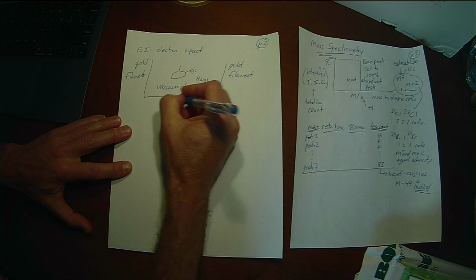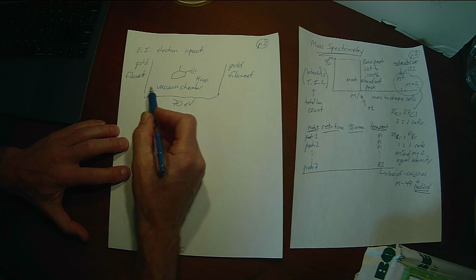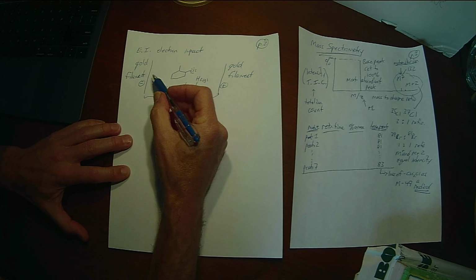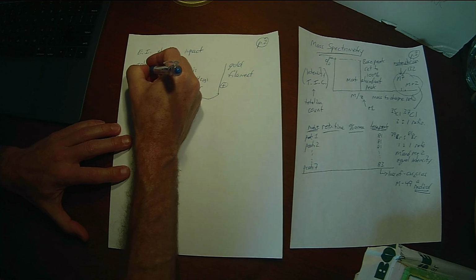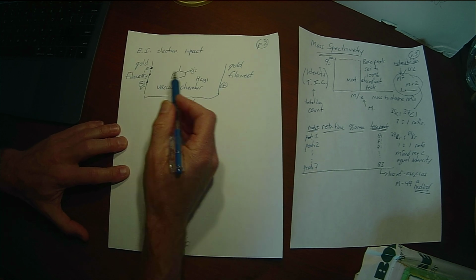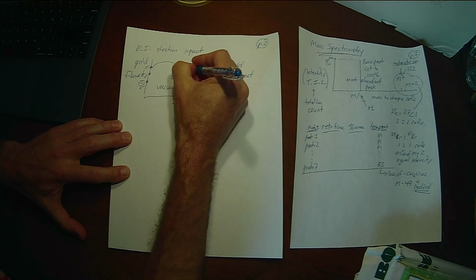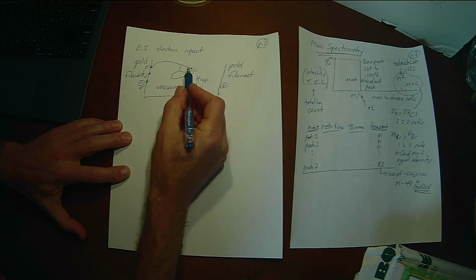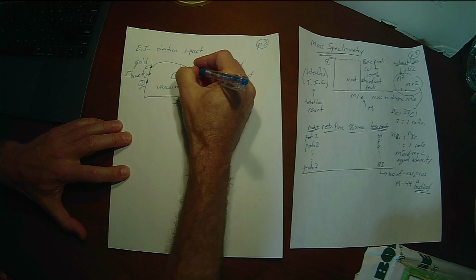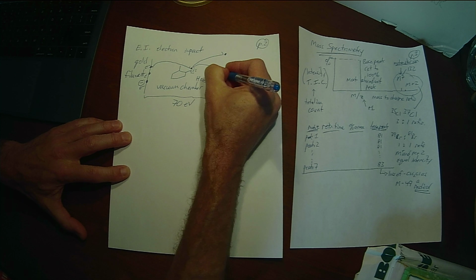And we set these to be at a potential difference of 70 electron volts. Right? So that's a large potential difference between these two filaments. There'll be a negatively charged and a positively charged filament. And as we build up charge on here, these electrons are going to sit on the surface. And eventually you'll have built up such a large energy difference that one of these electrons is going to shoot across. And sometimes it hits one of the electrons that's in the molecule. And when it does that, both of those electrons, the one that went colliding and the one it hit, are both going to go shooting off.